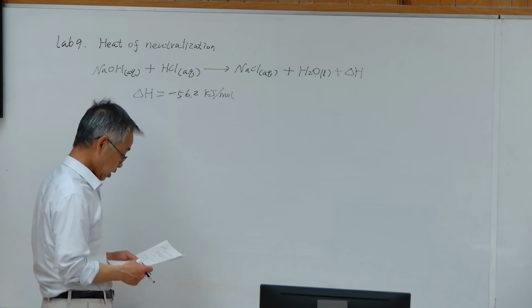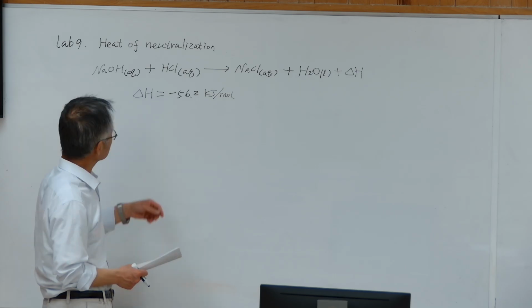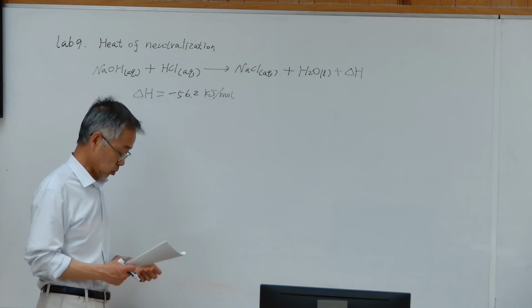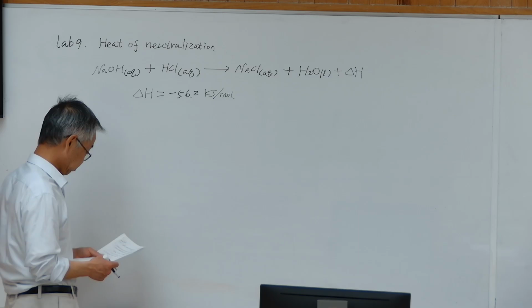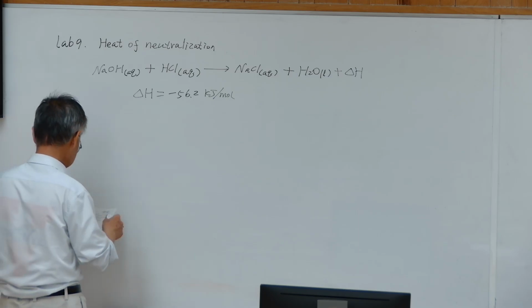So this value applies to any strong acid, strong base reaction. Let's say if this is KOH and this is HBr, then the same amount of heat will be released. So we're going to test today if this amount is correct, and we will measure the experimental value.